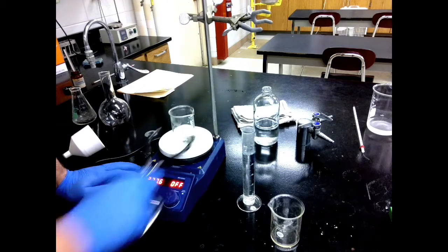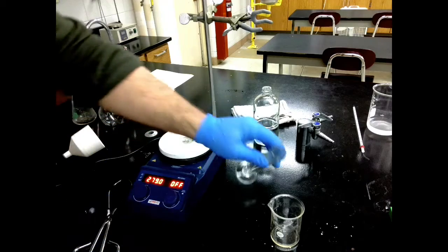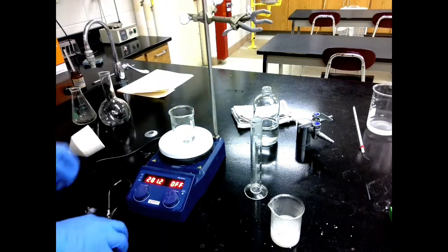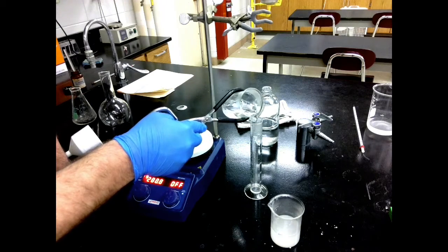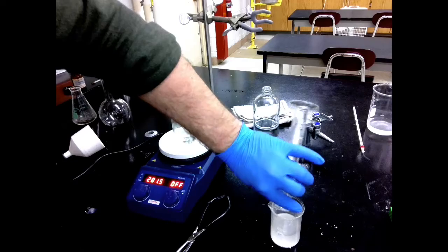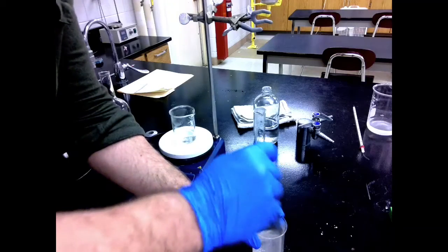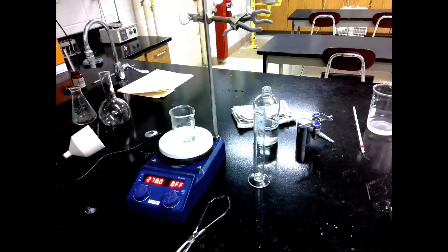There's 50 milliliters. So I'm going to take that 50 and I'm going to pour that into my beaker. I'm just going to add another 10 milliliters. Now that should be good. So when I do this step, what I'm really allowing to happen is the aspirin and all of the other impurities that are in it to dissolve in the ethanol and the water. And what I'll start to get as this cools down is I'll have pure aspirin precipitating out of this.